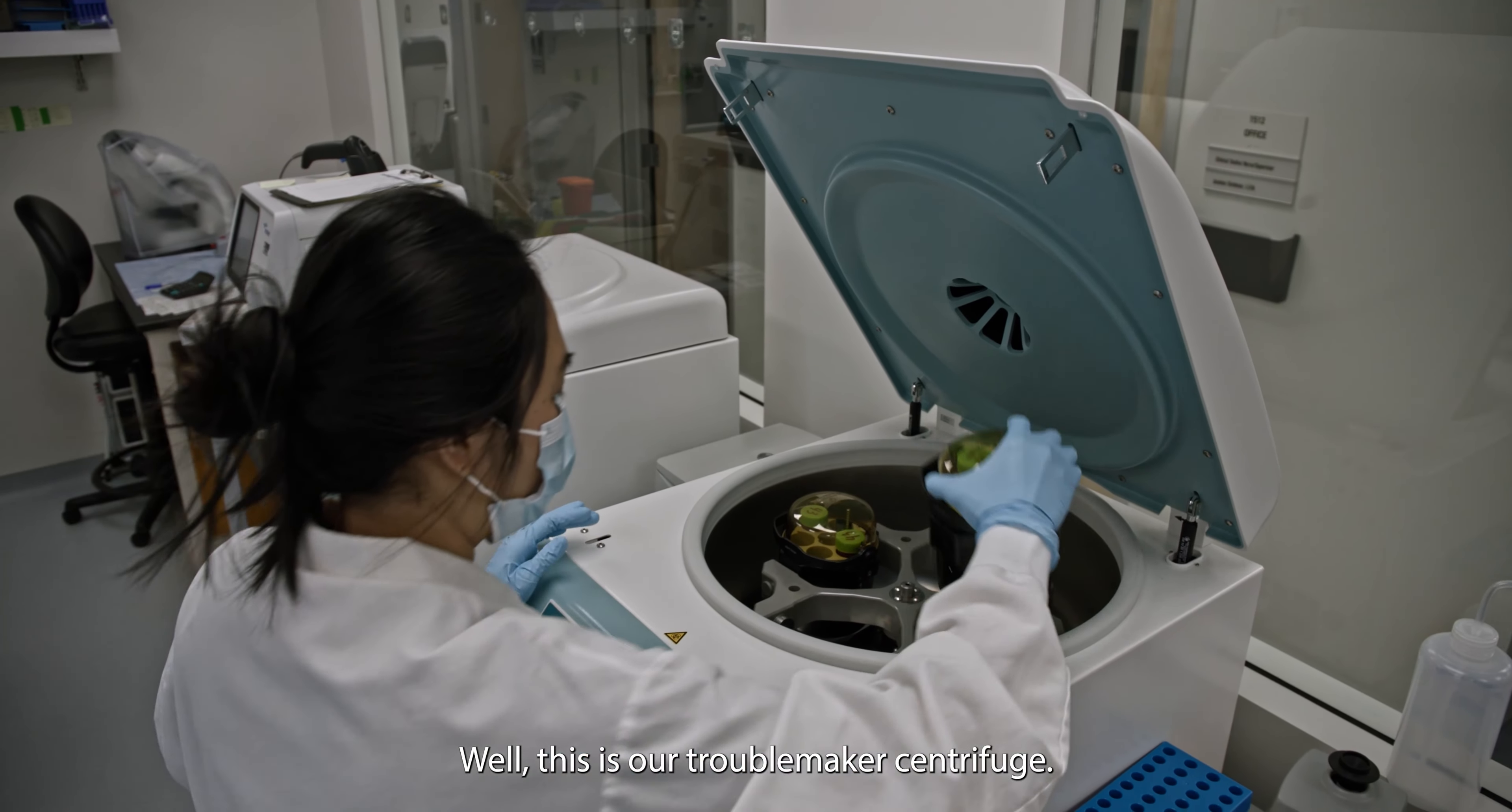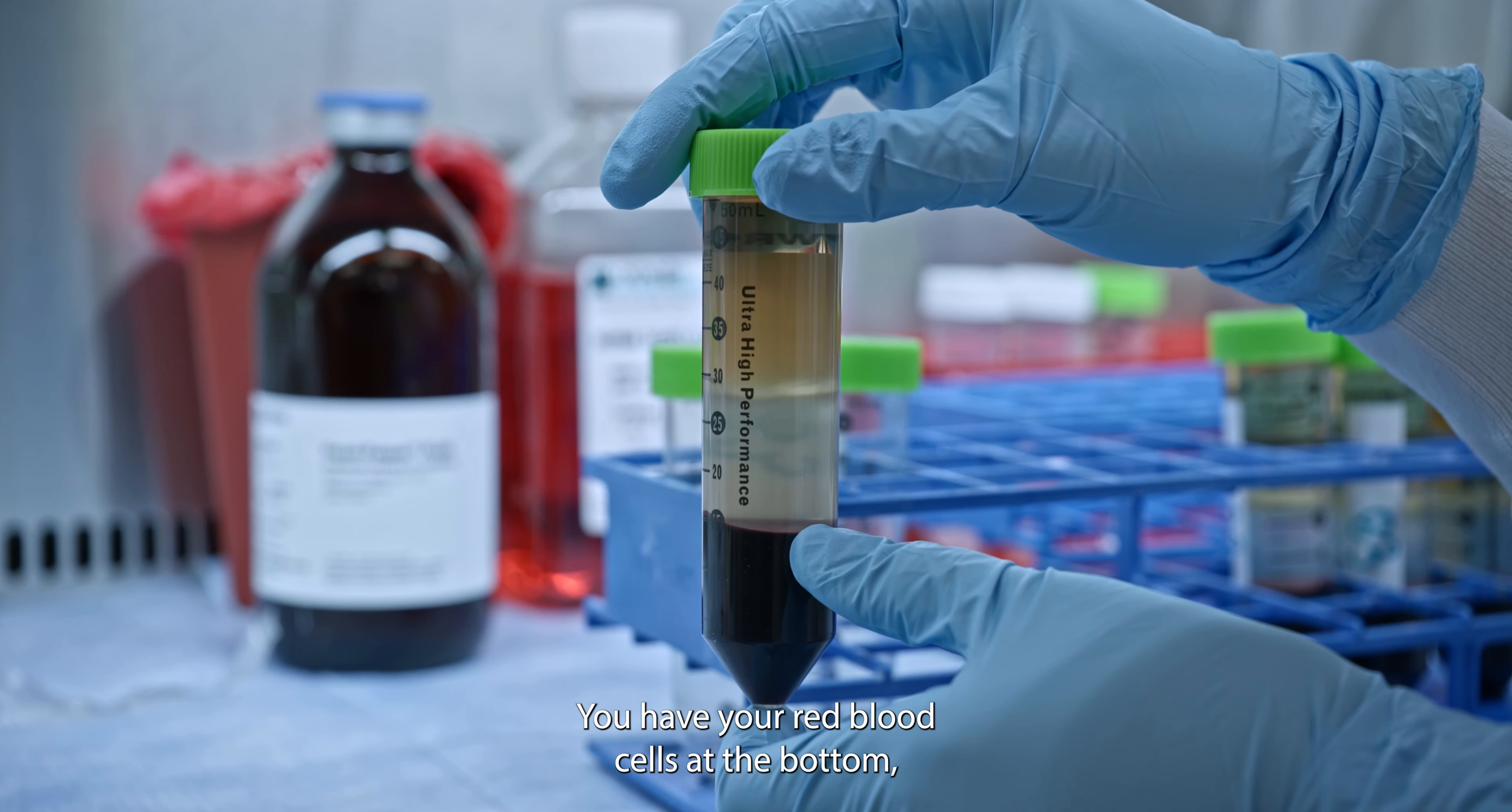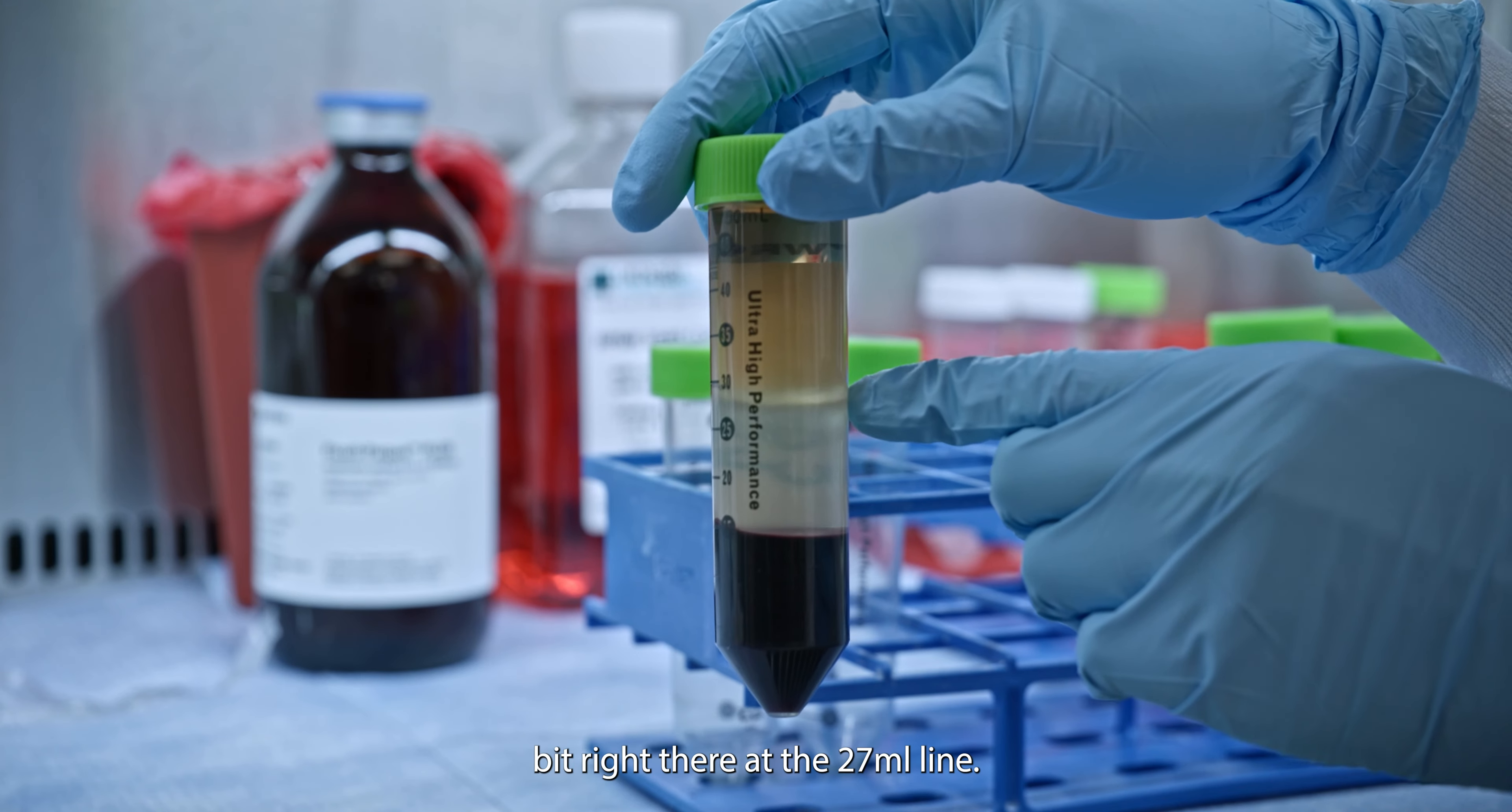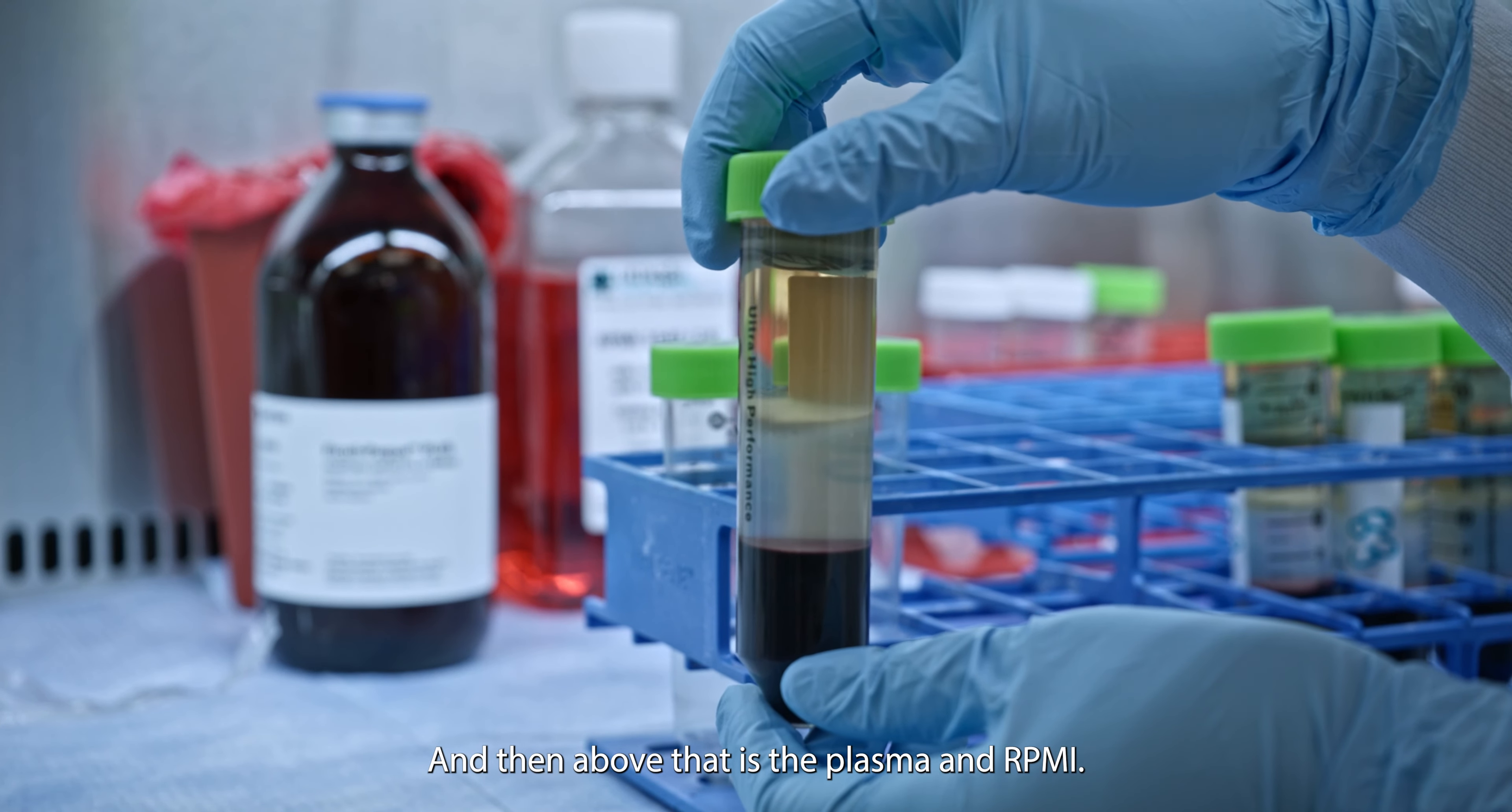This is our troublemaker centrifuge. Gotta slam it. This is a fully spun down Ficoll tube. You have your red blood cells at the bottom, the Ficoll media, the second layer, and then you have your layer of white blood cells. That cloudy bit right there at the 27 ml line. And then above that is the plasma and our RPMI.